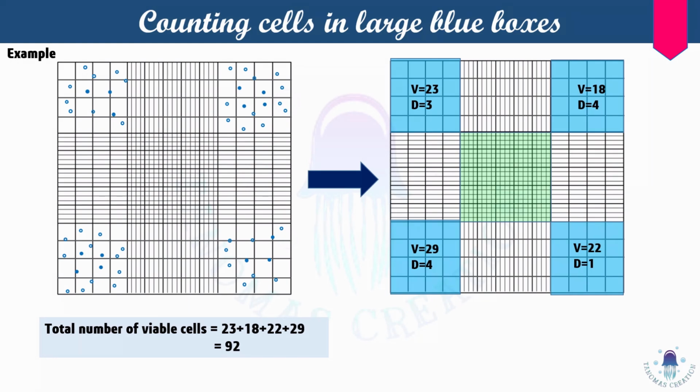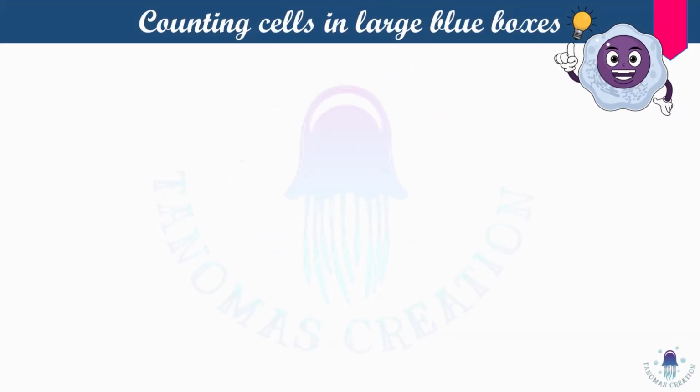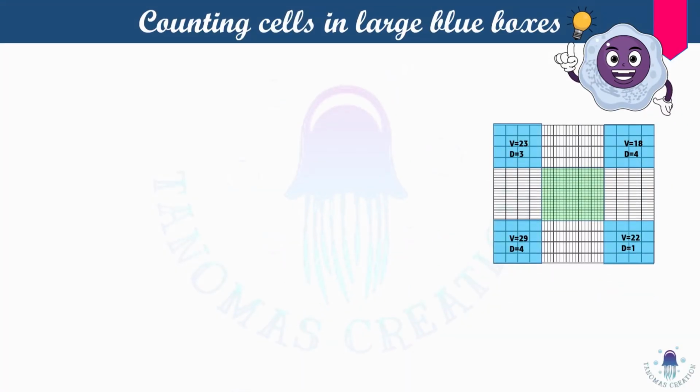Okay, so we can easily find out the total number of viable cells, that is adding all this up, 23, 18, 22 and 29, which gives 92. And the total number of non-viable cells becomes 3 plus 4 plus 1 plus 4 equals 12. Okay, it's very easy to find out. Now coming to the average number of viable or non-viable cells.